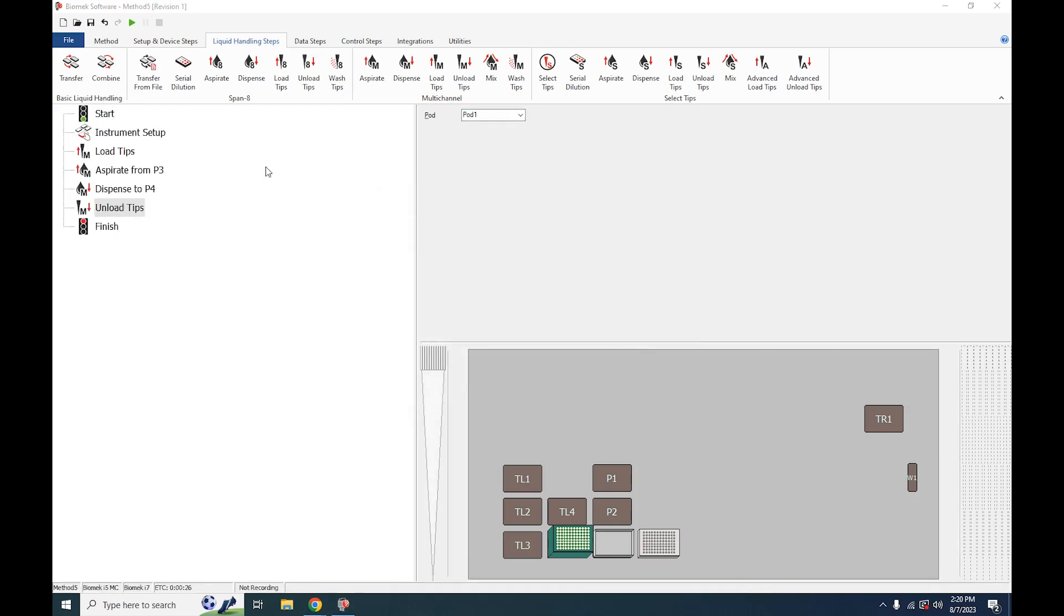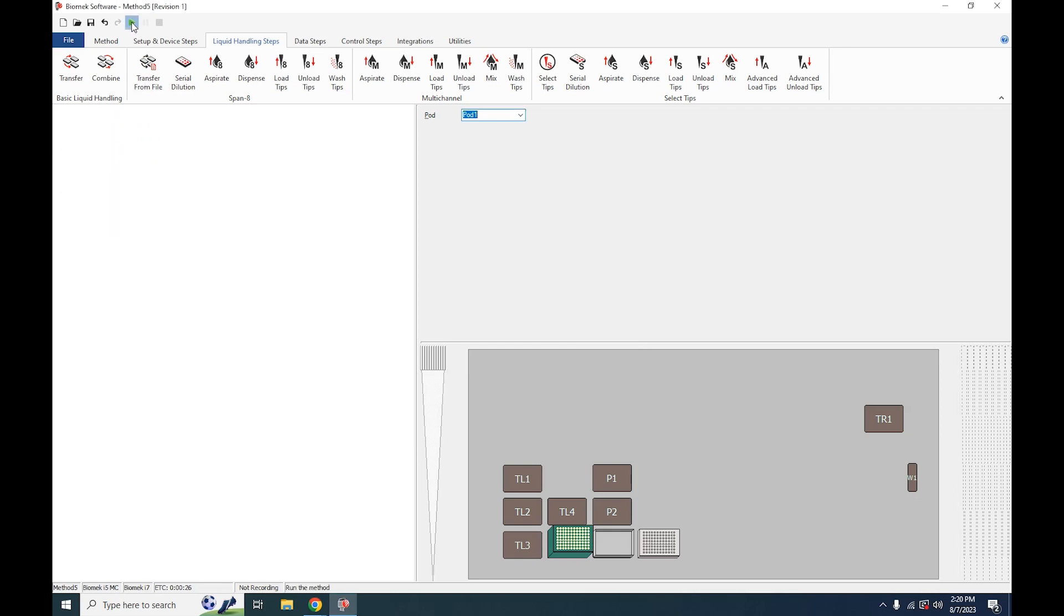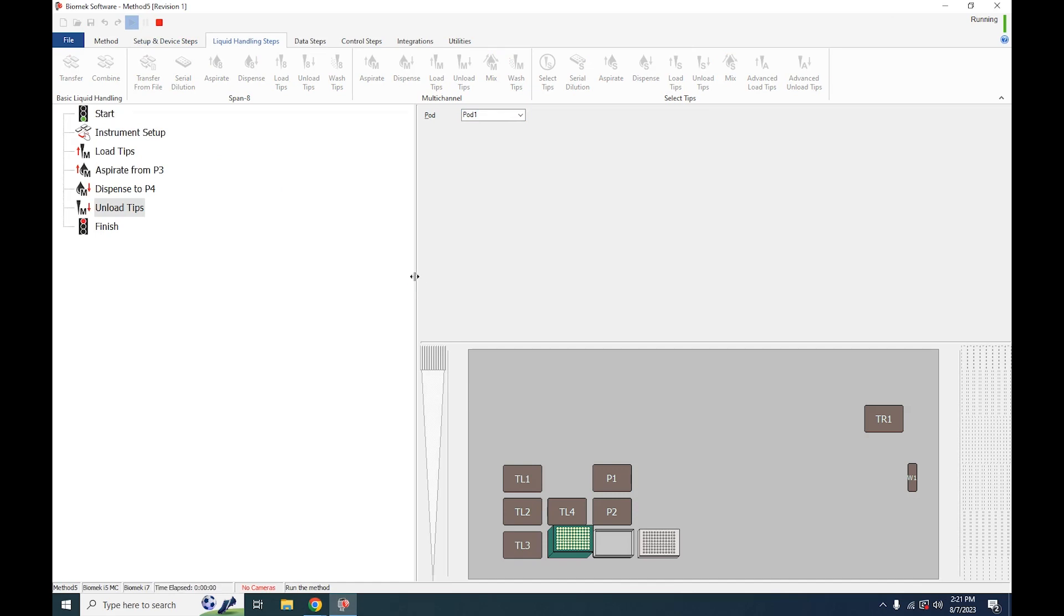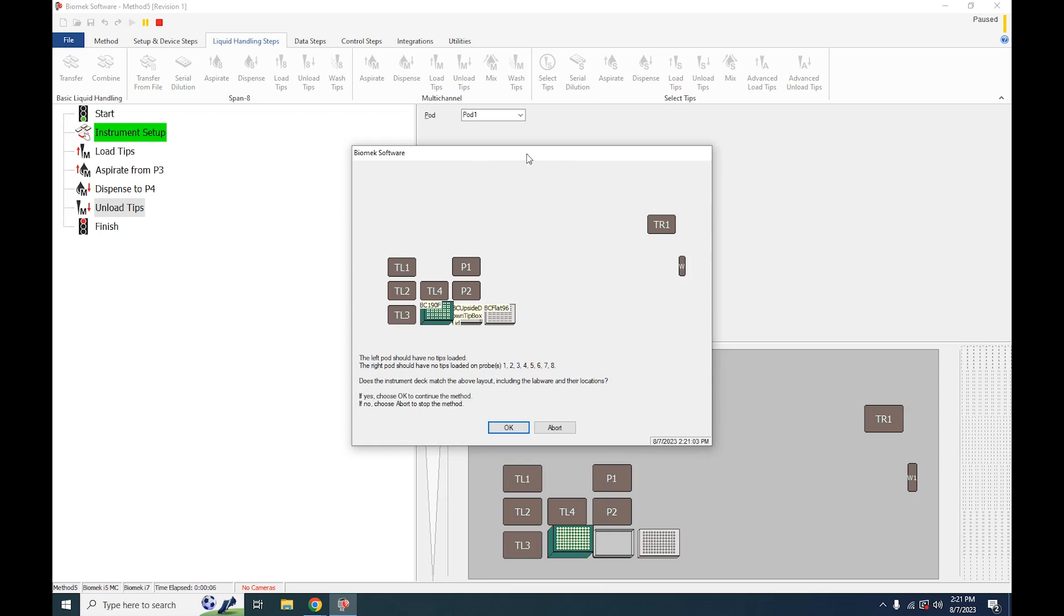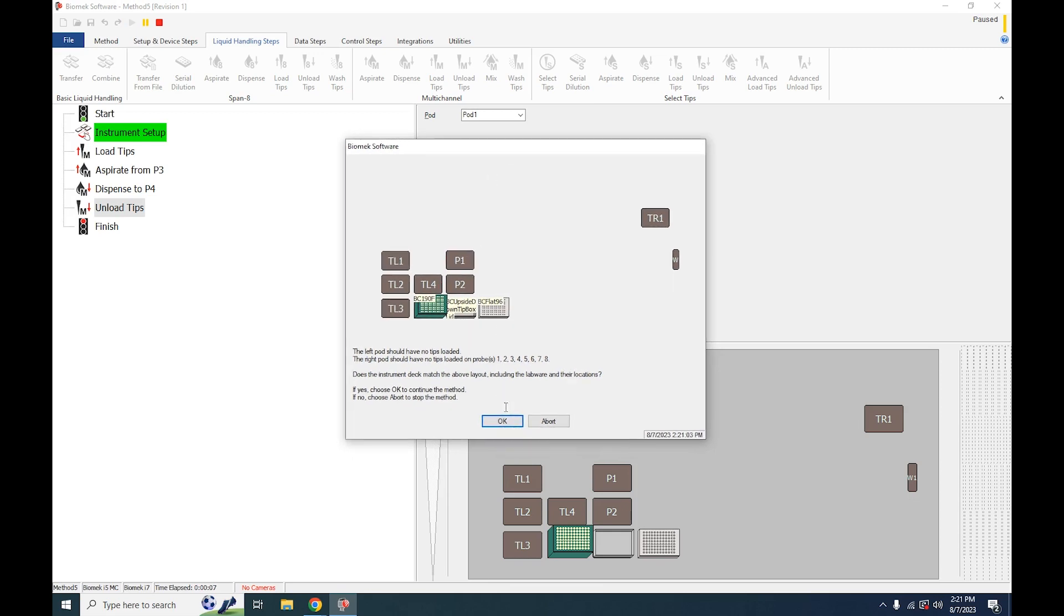Go back to the top left, find the green arrow and click that to start your run. A popup of your deck should populate the screen, and finally you hit OK if everything looks right, and your run will begin.